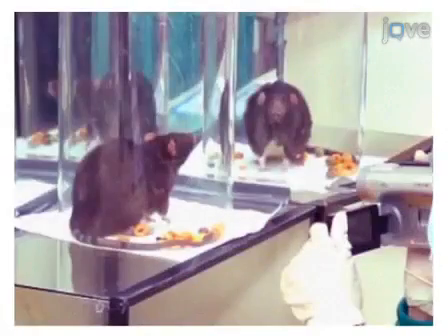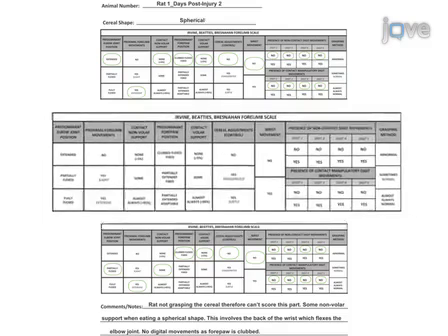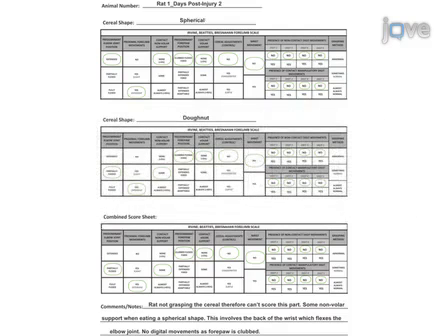The animals are then recorded while eating two differently shaped cereals of a consistent size. The videos are used to assess features of forelimb use, such as joint position, object support, digit movement, and grasping technique, and the presence of different behavioral features is recorded onto the IBB score sheet.